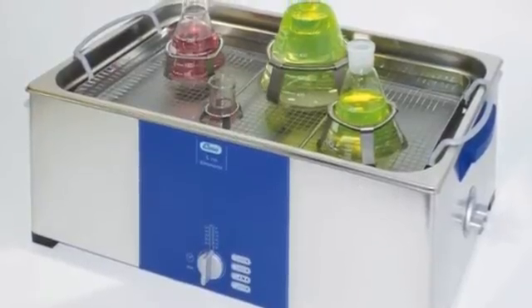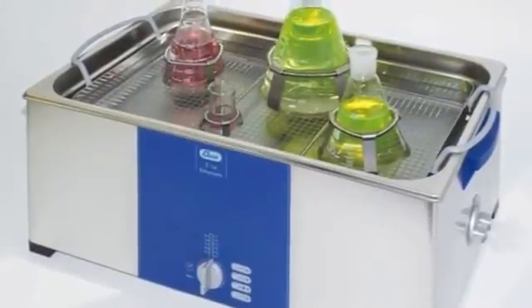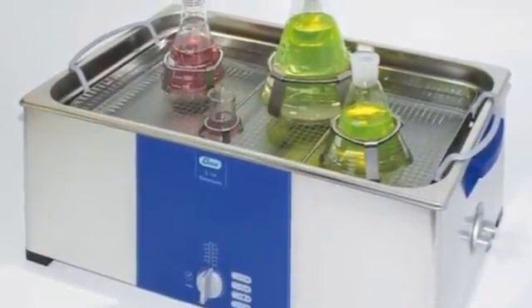Now if you've got a bunch of samples to do at one time and you've got a bigger unit, you can put 10 to 12 of these in at a time.